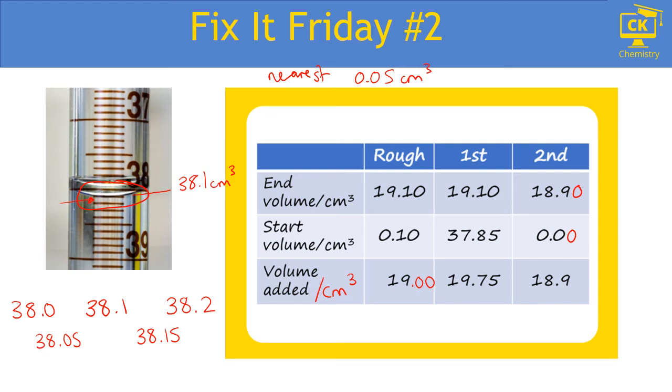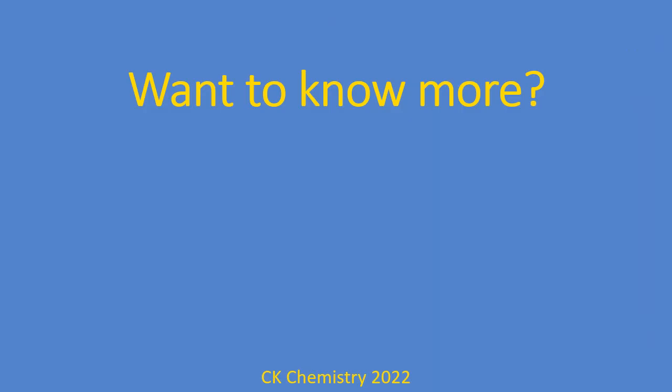There is one more error in this table: the value in the second column is actually wrong. If I take 19.1 from 37.85, I get 18.75. Well done if you spotted that, because it means you actually checked the calculation rather than assuming it was right. When I tell students to check their calculations, often they just look over it and think 'yeah, that looks right,' instead of putting the numbers back into the calculator to verify.